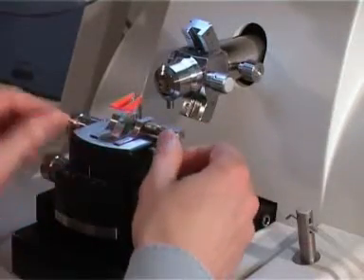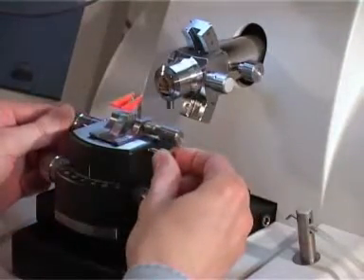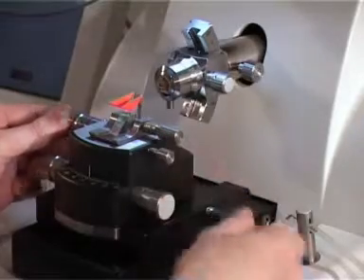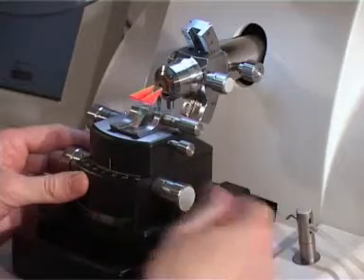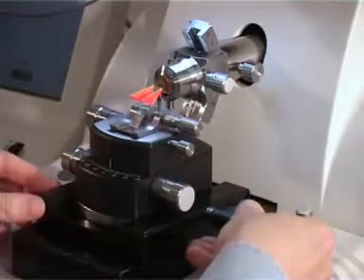A glass knife with a trough attached is secured in the knife holder and the clearance angle adjusted to six degrees. The knife block is then moved towards the specimen and clamp.